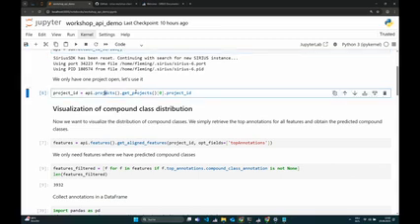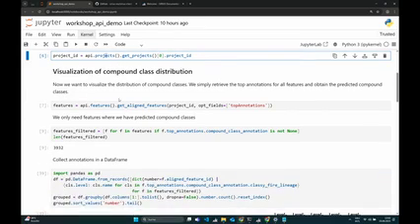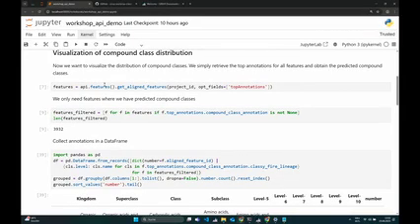Now, it might be that you have multiple projects open, but for this we will just open the first project that we have with this box. And I just want to show you one example. That is, of course, so let's just go briefly back to SIRIUS. You can export everything with this summaries button, but everything that you have is also available in the API. And this is what I will do here now. I will get all the features that we have found with this code snippet.